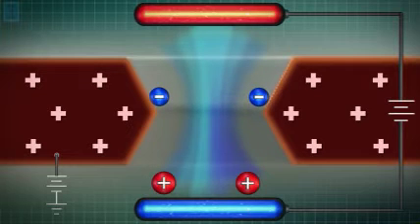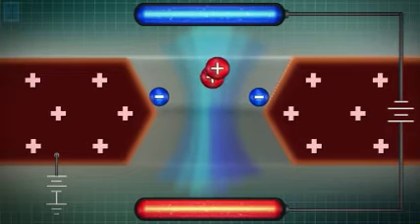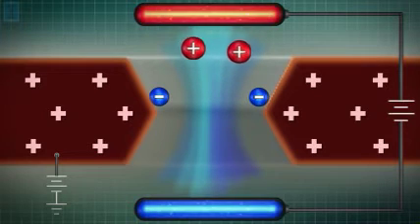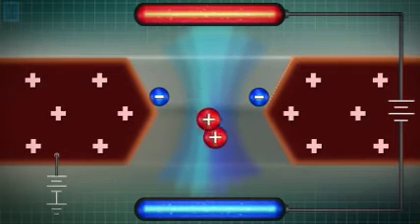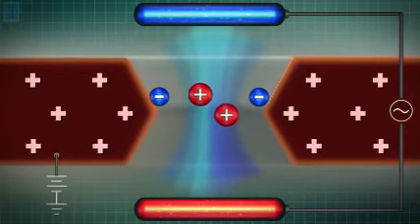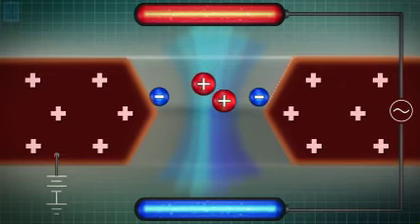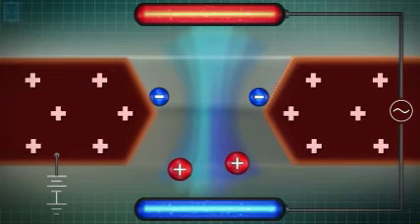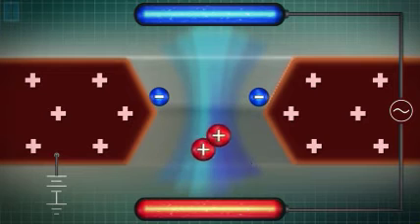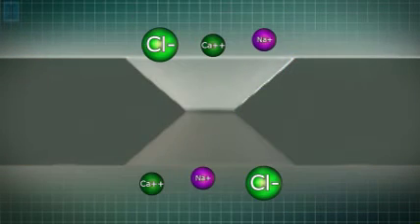So far, the demonstrations have illustrated the technology operating with direct current. However, one very important aspect of this technology is that it can operate with alternating current. This transition to adjustable alternating current character is very useful for trapping or selectively filtering complex entities. Remember that the physical cross-section you see here is adjustable in many ways.